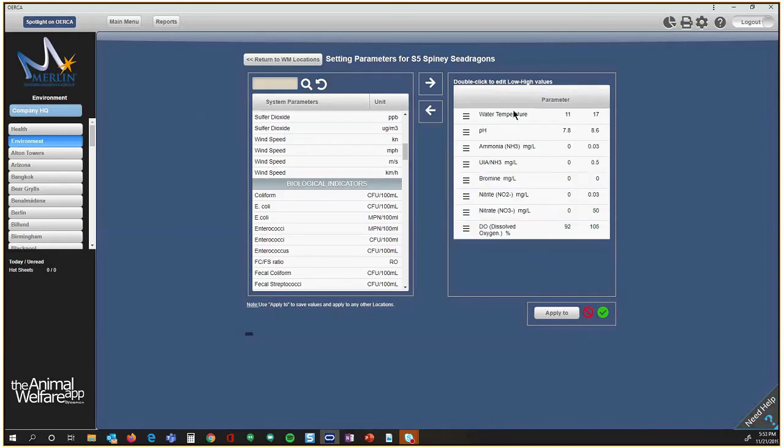This is the order, by the way, that it would show up in the manual entry. So if your YSI probe or Hawk Analyzer always spits things out in one particular order and you want to match that, you can. So that's how you change the order.